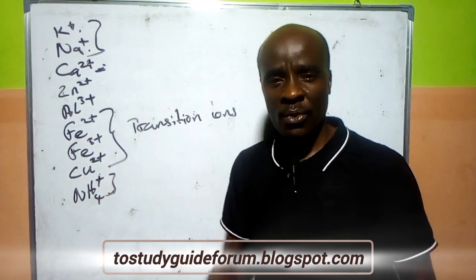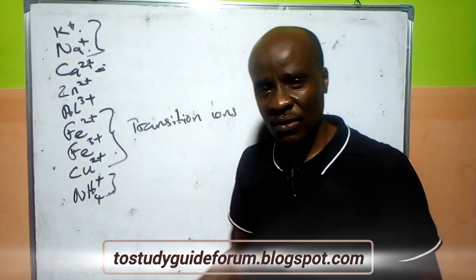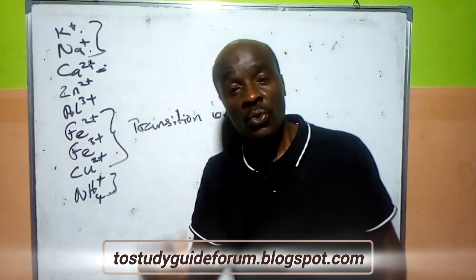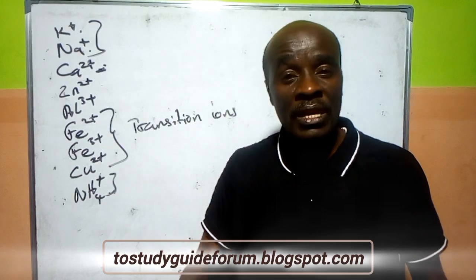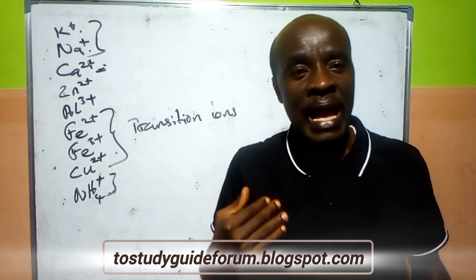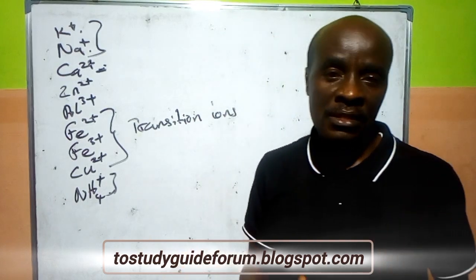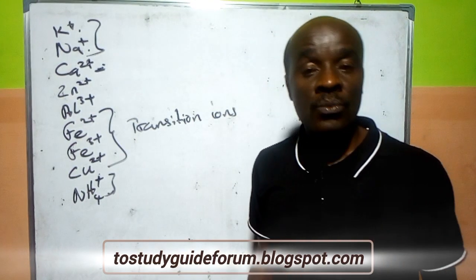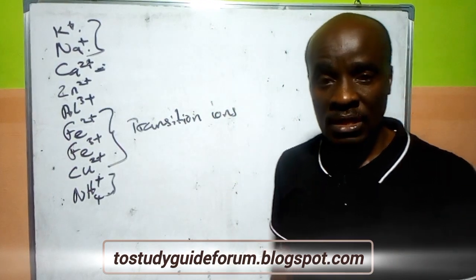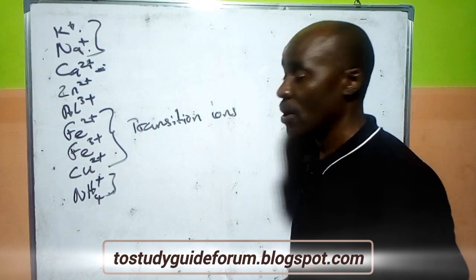So that's why I choose to do it this way, so that at the end of the day, when I'll be analyzing the ions, you find out that whatever I'm inferring aligns with the predetermined test that is meant for that very ion.